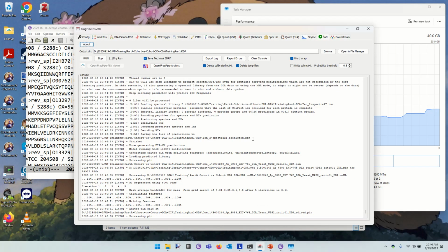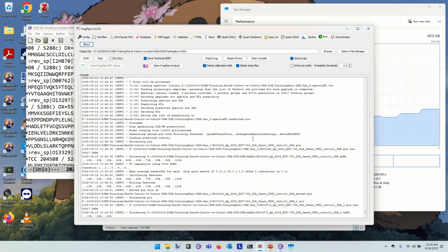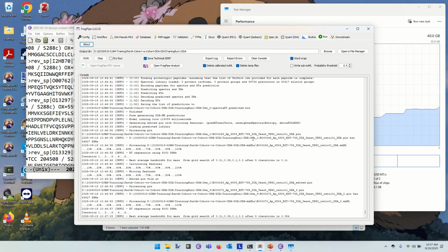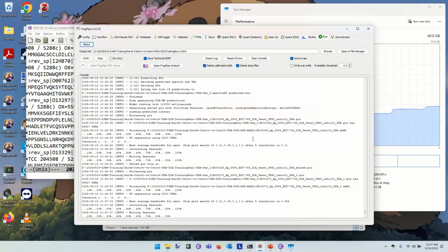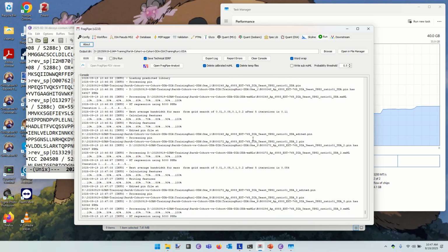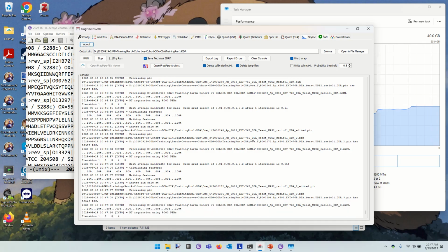In general, if you give data to MSFragger, the simplest way to do it is just to use the raw files as produced by the instrument. Because this is a tutorial handed around the class on a thumb drive, I try to keep what I hand you very, very compact. And in my case, shrinking the data by peak picking them and writing them as mzML made it a lot easier to hand those out on a thumb drive in a very compact format.